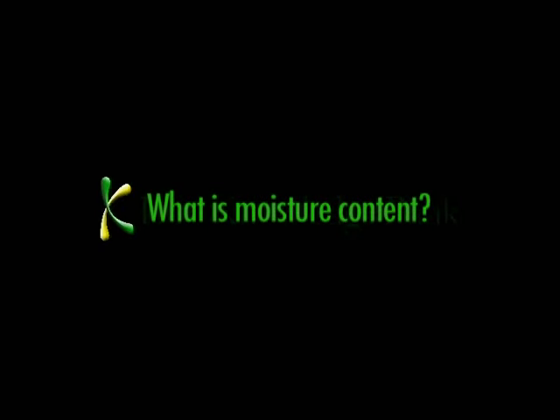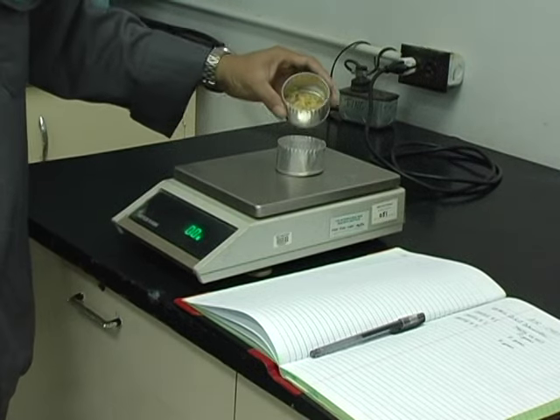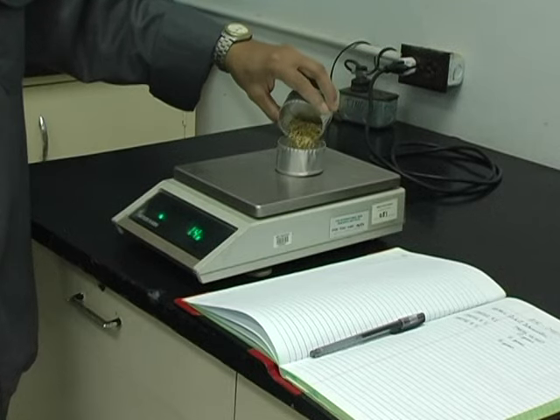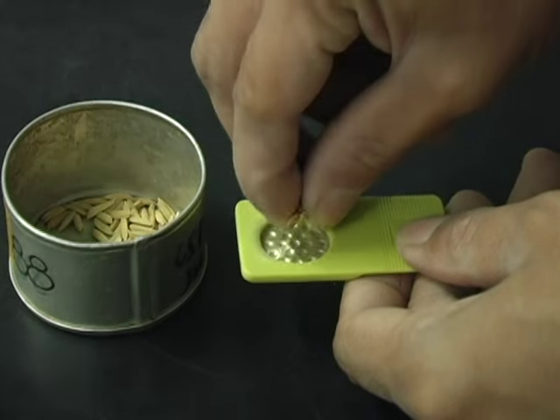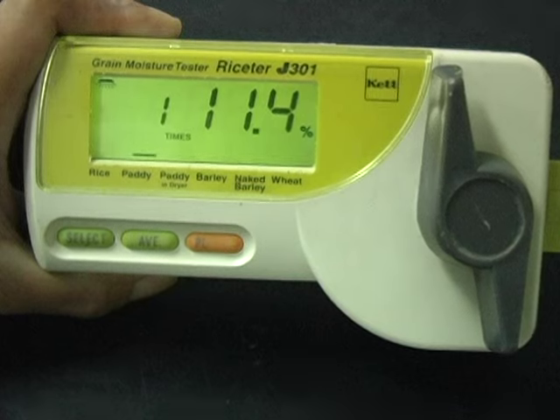First, let's explore what moisture content is. Moisture content is the weight of water contained in paddy or rice and is expressed as a percentage. For example, you might dry your grain to 14% moisture content or your seed to 12% moisture content.